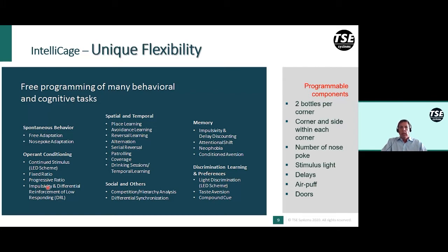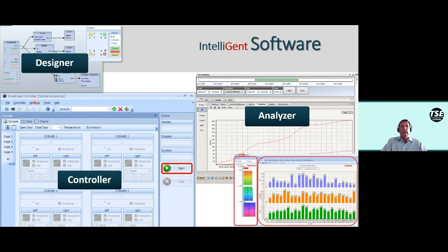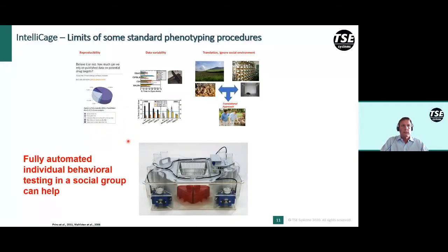The IntelliCage software has three main parts: the Designer, the Controller, and the Analyzer. The software is very user-friendly and graphically oriented. The Designer is used for designing behavioral tasks, which are then saved and loaded into the Controller, which executes the behavioral paradigm.